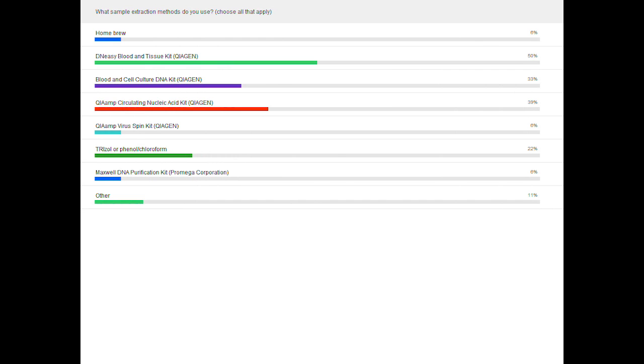Okay, it looks like most people are using the QIAGEN kits, the DNeasy Blood and Tissue, Blood and Cell Culture, and the QIAamp Circulating Nucleic Acid kits. Excellent.